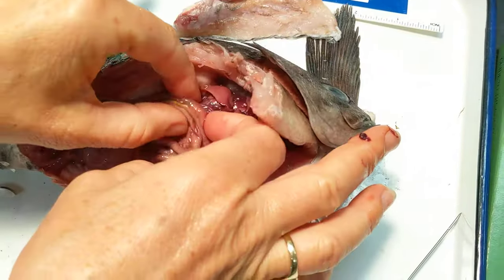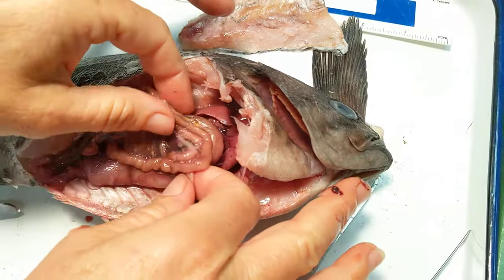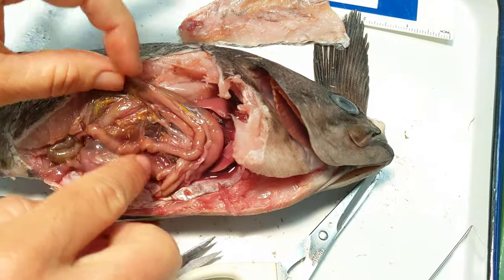We can start to follow along in the intestines. You can see the intestines wrapping around here, and the pyloric caeca with some fat reserves on them.